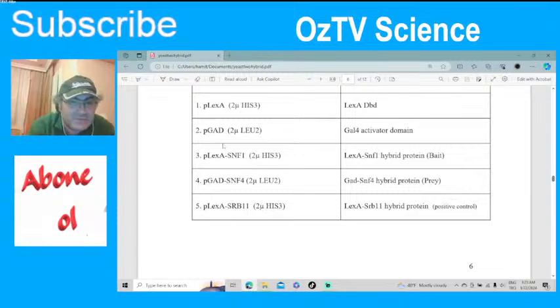If SNF1 and SNF4 come together in the cell for a specific function, hypothetically, since SNF1 is fused with one protein and SNF4 is fused with another activating protein, these two will turn on the reporter gene, and you get a color, and then you will say that SNF1 and SNF4 work together.